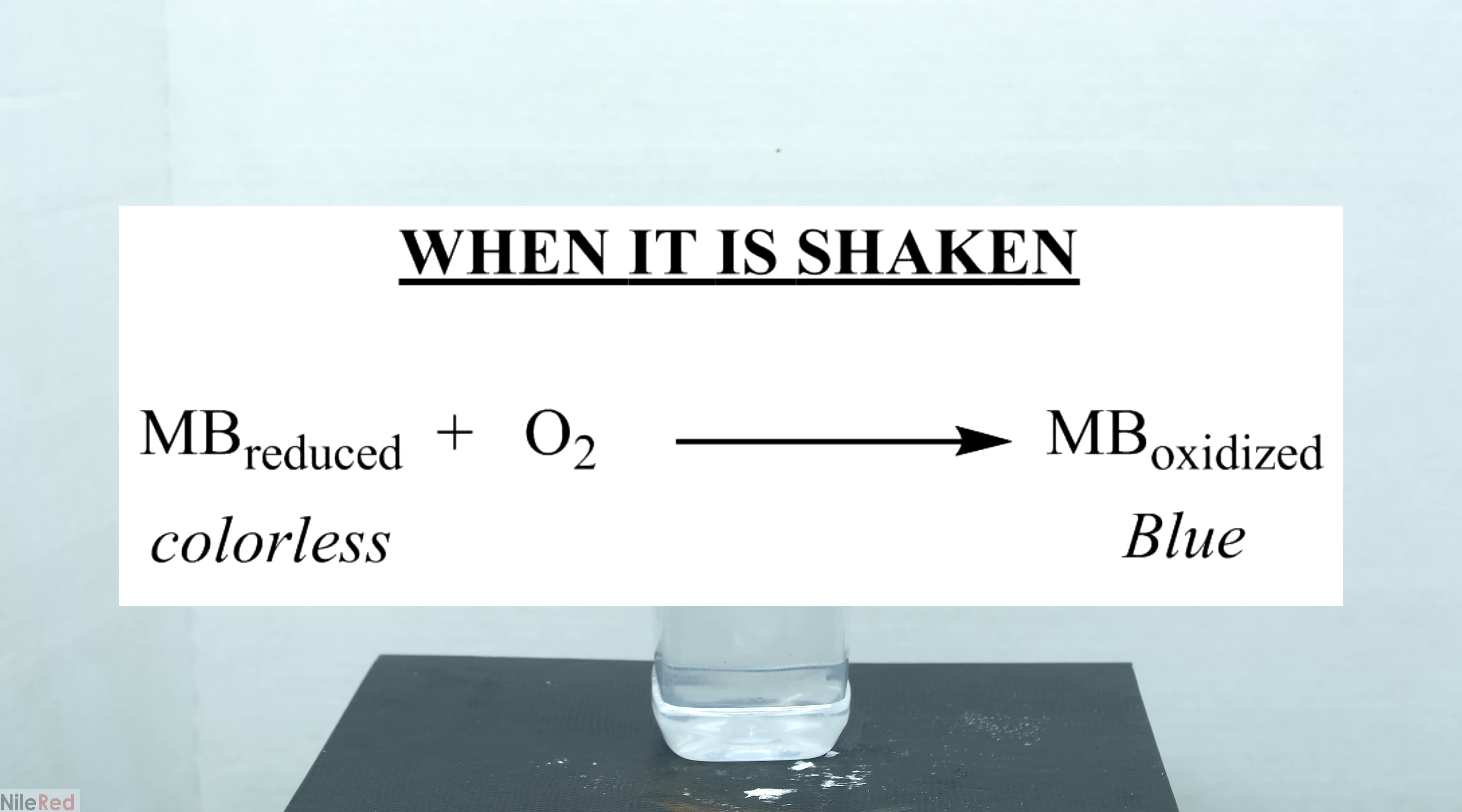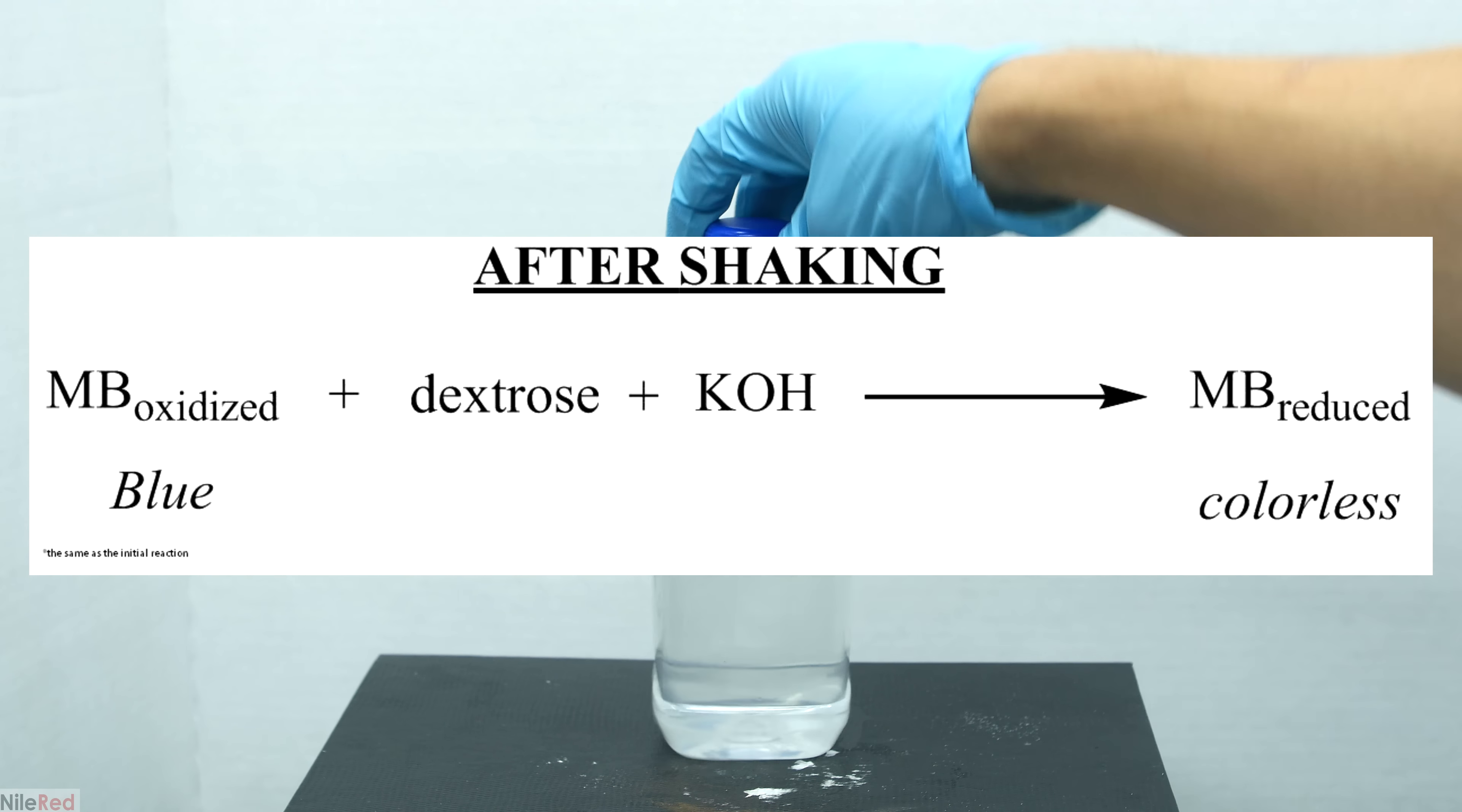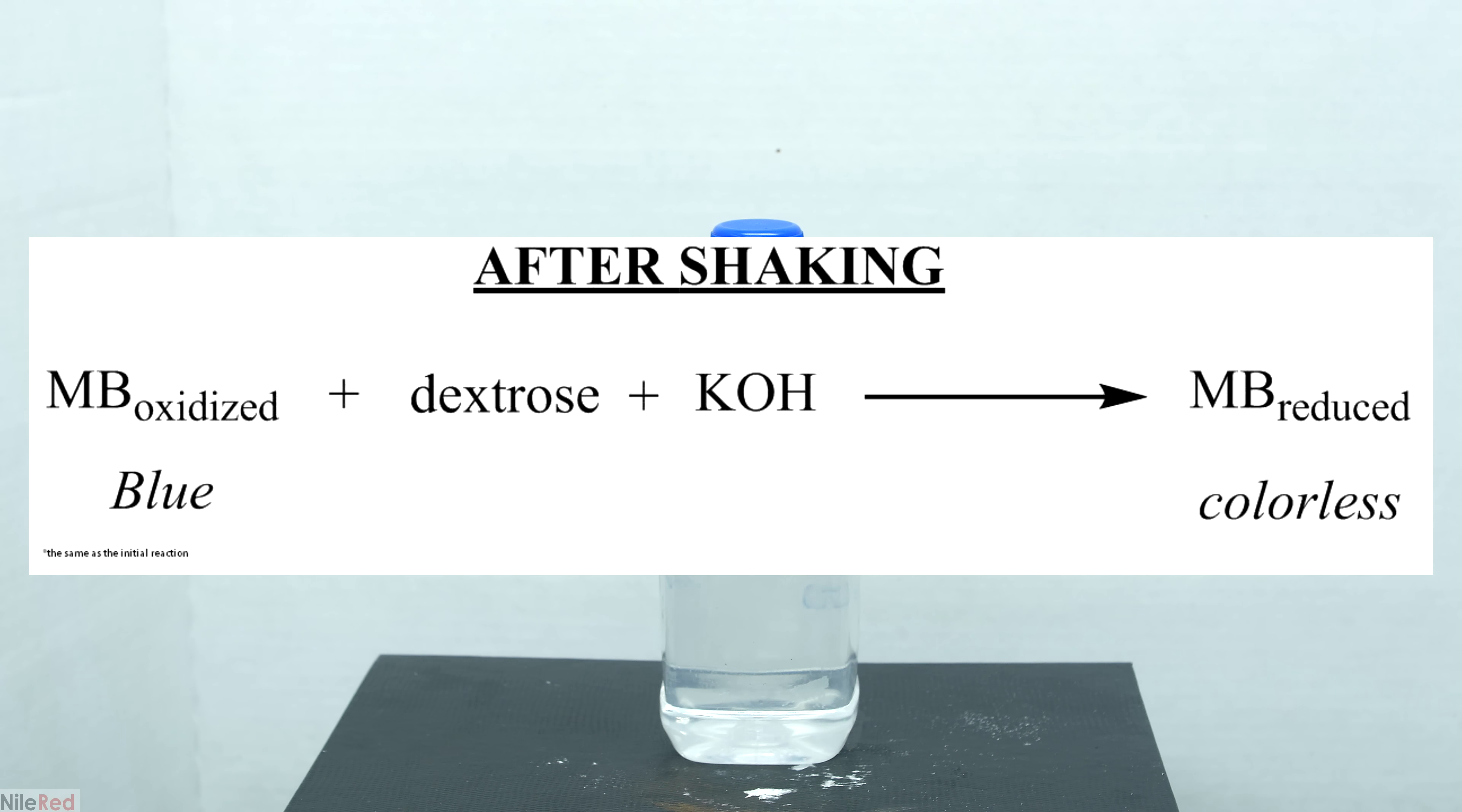When we shake the bottle we introduce oxygen gas into the solution and this is able to oxidize the methylene blue back to its colored form. Once we stop shaking the bottle though we stop introducing oxygen and the reducing effects of the dextrose and potassium hydroxide slowly take over and convert it back to its colorless form.